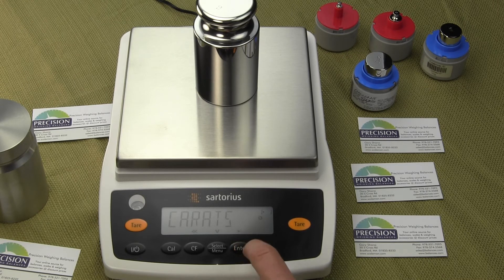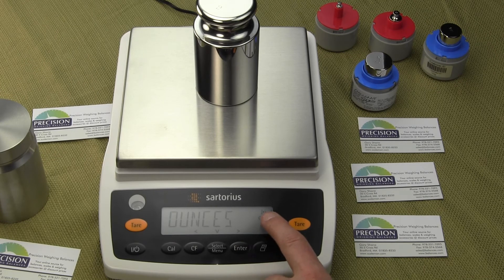You'll see a zero there confirming it's stored. To select the next weigh mode, simply press the arrow key. You'll notice now there are two dots in the upper right-hand corner. To set this next weigh unit, press the select menu key — user-defined, grams, kilograms, we've already selected carats — this time let's select ounces. To store that value, press enter. You'll notice a zero there, which signifies that the second weigh unit is now ounces.